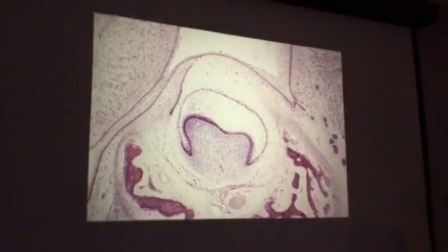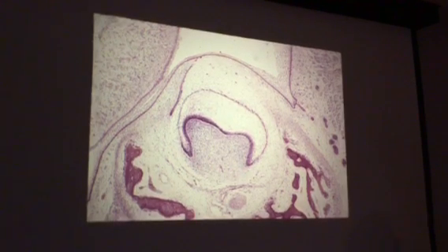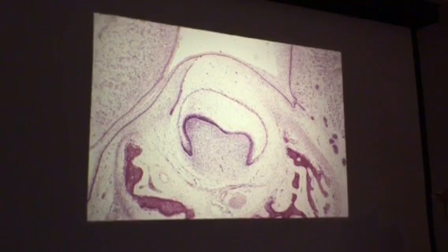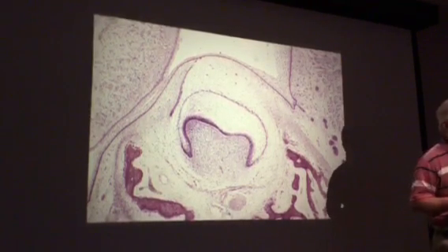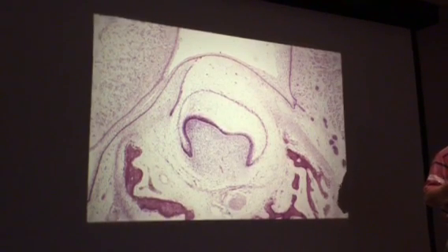How about this stage right here? That's kind of tough. Early bell, perhaps. Late cap. Depends what I feel like that day. And right there is what? Permanent tooth.